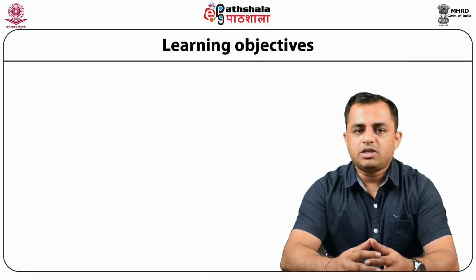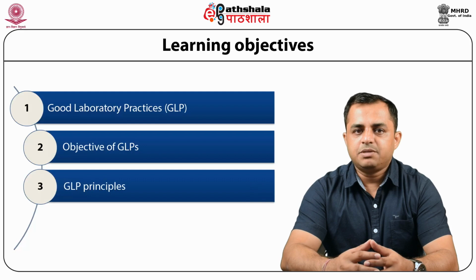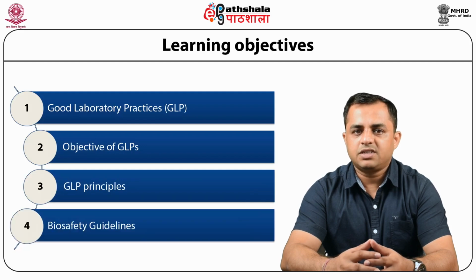I am Dr. Ranjit Singh from the Environmental and Industrial Biotechnology Division, The Energy and Resources Institute, TERI, New Delhi. Today we are going to talk on the module General Principles of the Laboratory and Biosafety under the paper Environmental Biotechnology. In this module, we will learn about good laboratory practices, the objective of GLP principles, and about biosafety guidelines. So what is good laboratory practice?